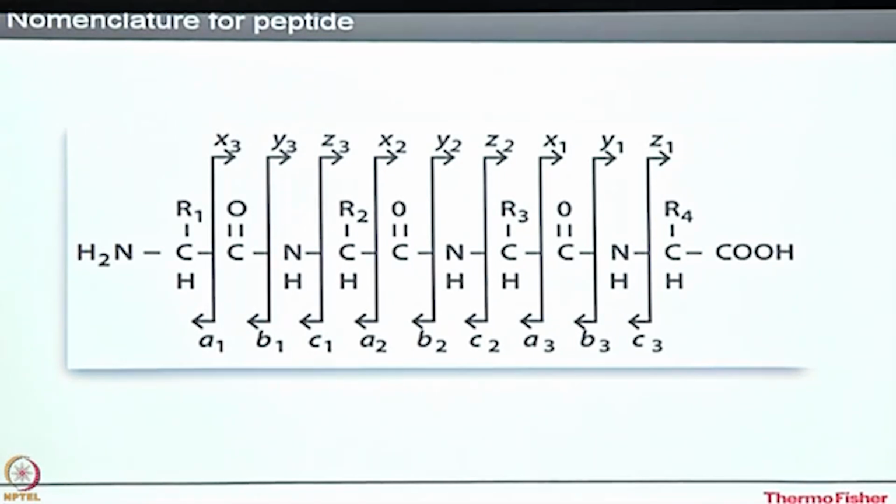Okay. So there are different ways of fragmentation: CID, HCD, ETD. Different fragmentation will give you different kinds of ions. In the case of CID, you will get only b and y ions. In the case of ETD, you will get c and z ions.